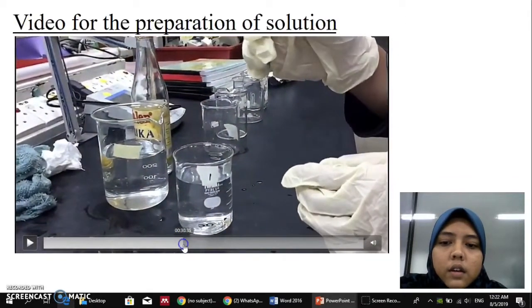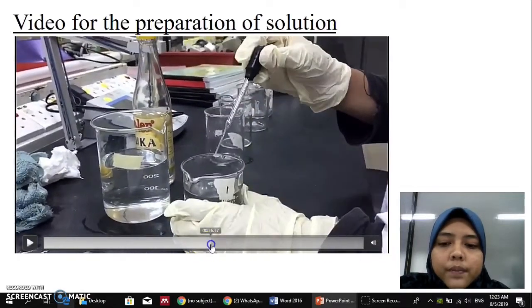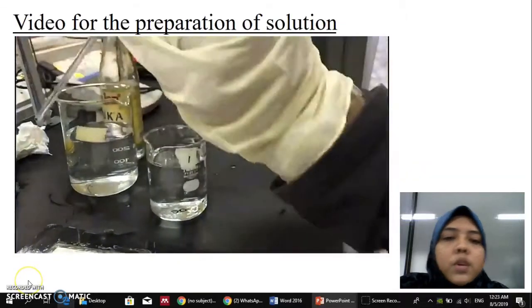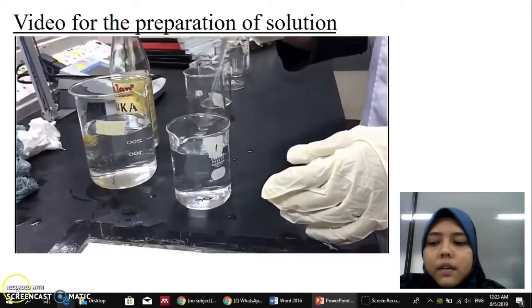Then the water was mixed with the dropper. The step was repeated until beaker 2, 3, 4, and 5.